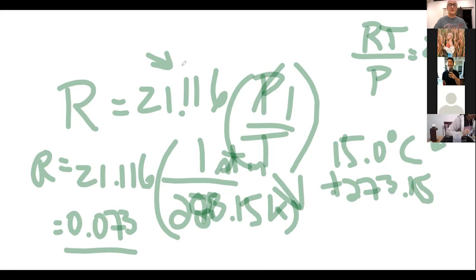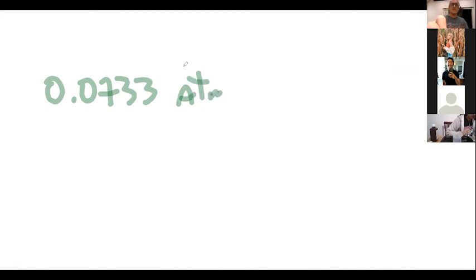The actual value, anyone remember what the actual value of R is? So I calculated 0.0733 atmosphere liter per mole kelvin.